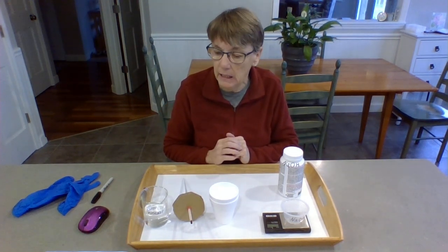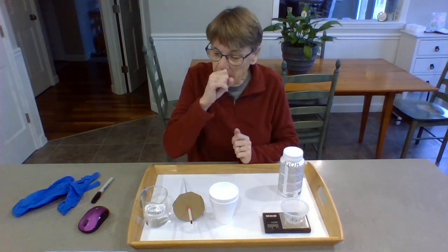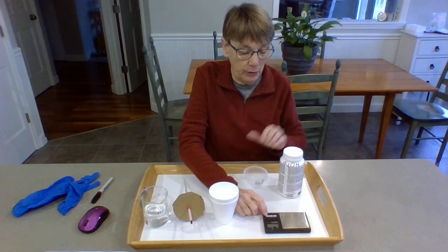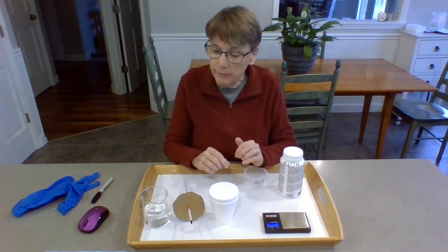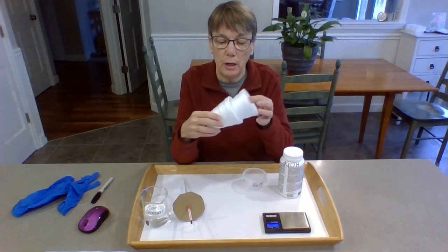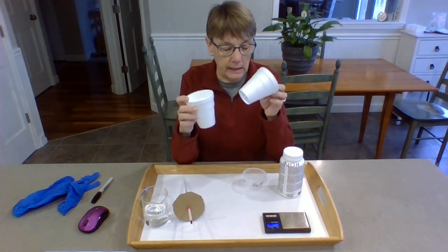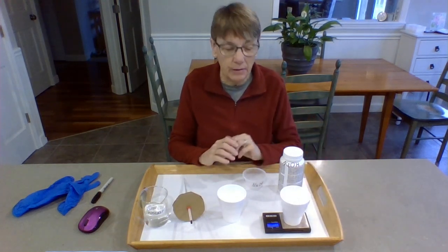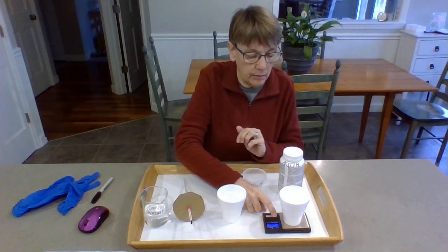So the first thing we're going to do is turn on the mass scale. I've got a scale just like we use in class. I'm going to turn it on. And this is my calorimeter, 2 styrofoam cups nested together. I'm going to take the top one out, put it on the scale, and tare it.